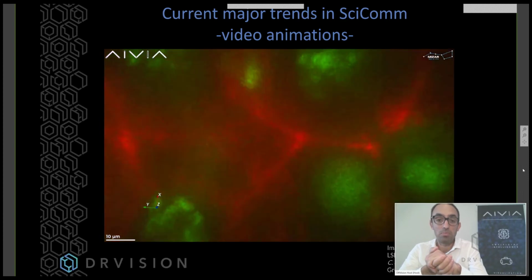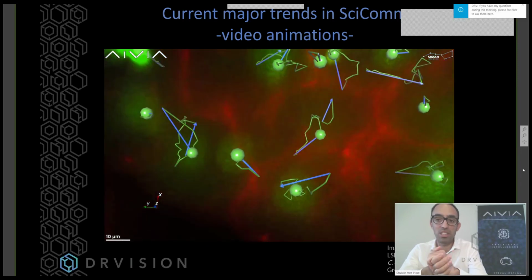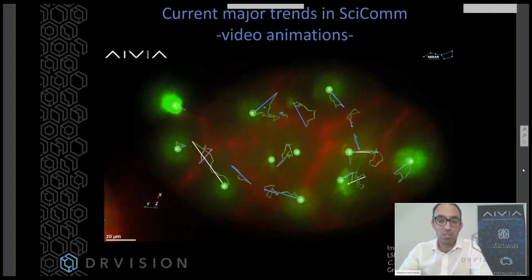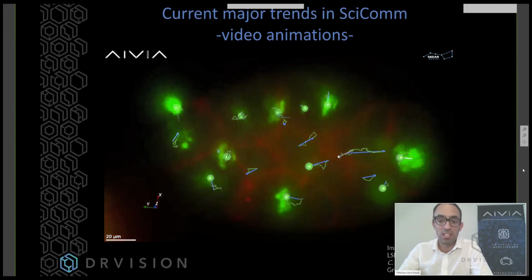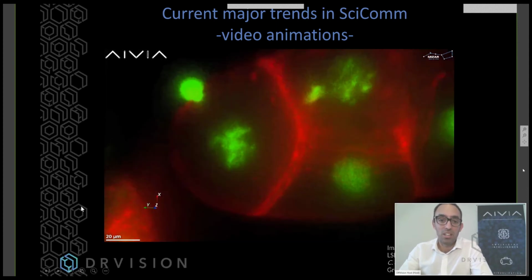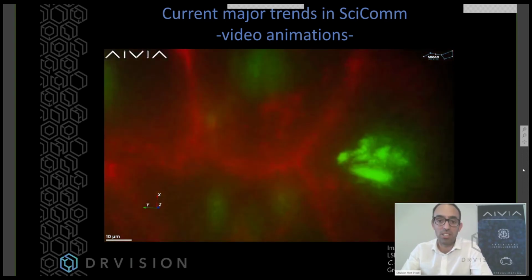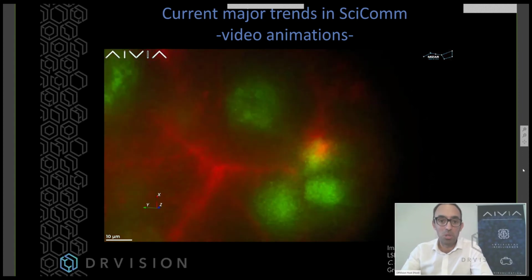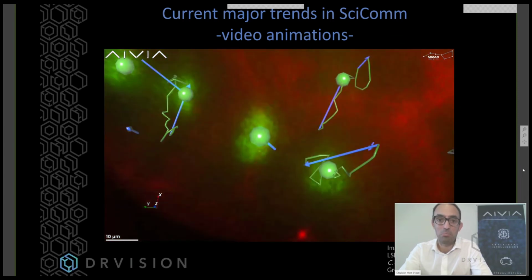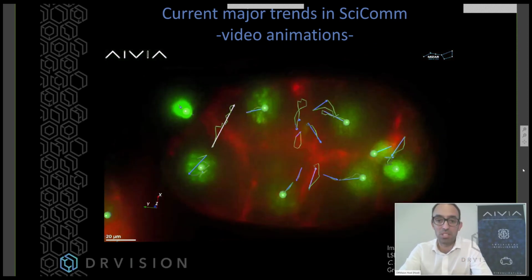These two videos that I just showed here have been created with the light sheet microscope that is currently commercialized by Mizar. It is the Mizar Tilt, and Patrina maybe can add a little bit more information about it later. But it is a type of light sheet fluorescence microscopy. And in this case, we see a C. elegans roundworm undergoing a few rounds of cell division. The video illustrates that we can actually track and display the tracks of this cell division. So the embryo is able to go through several rounds of cell division without any apparent problem or phototoxicity, which is great and is what is expected from this kind of microscope.